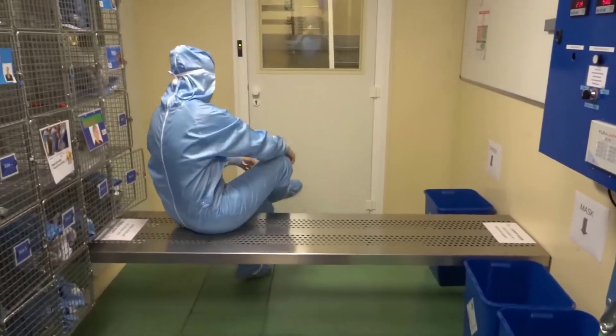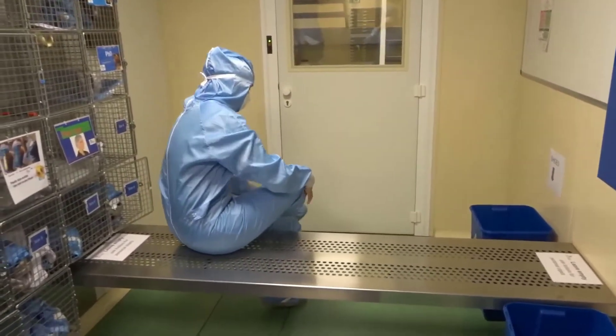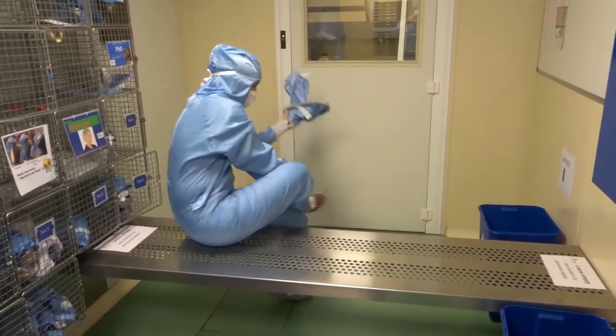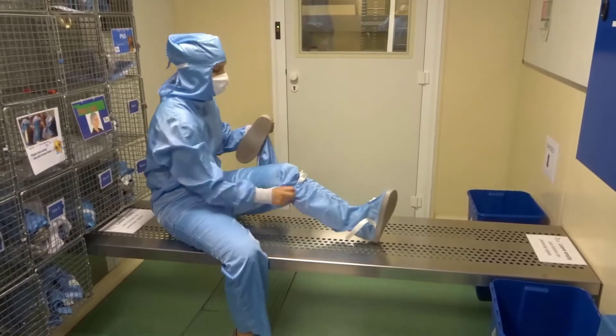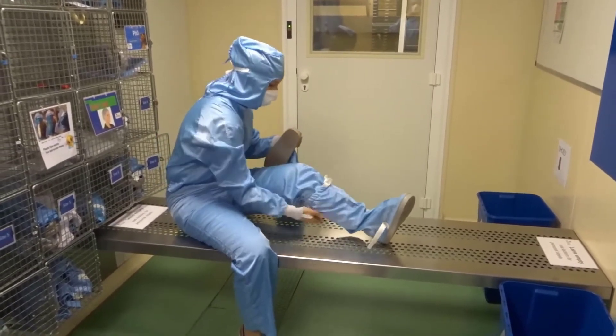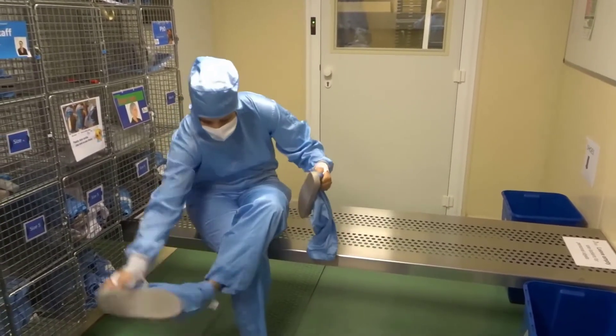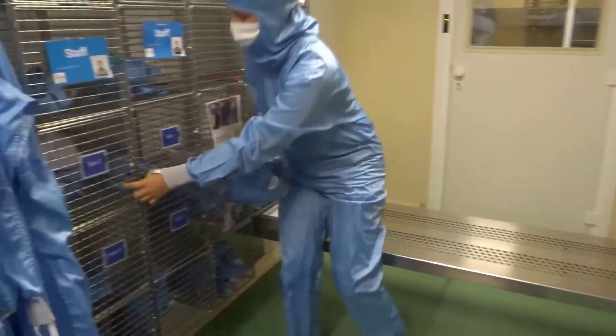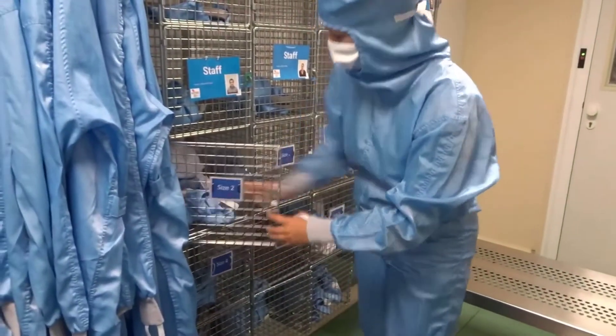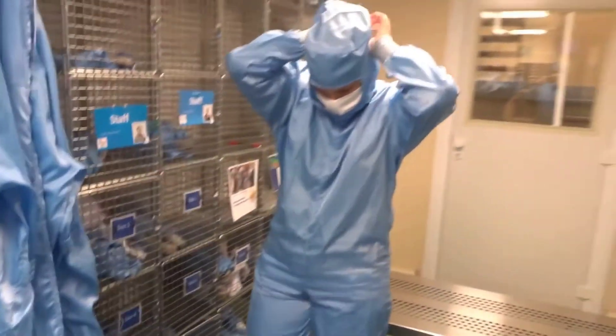You can now undress by doing the exact opposite procedure to the one you did on entry. Put back the overshoes into the right compartment for other people's use, and then remove the garment.